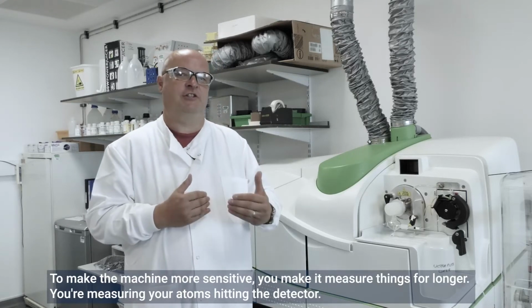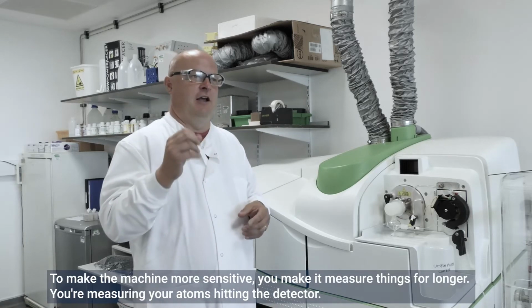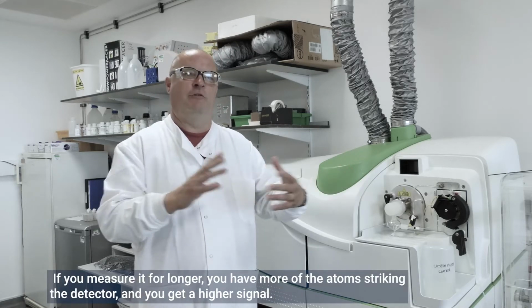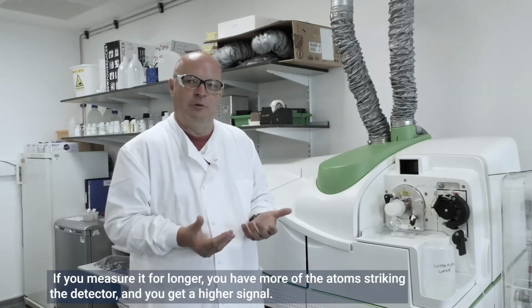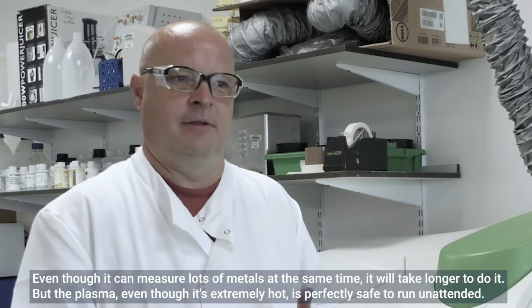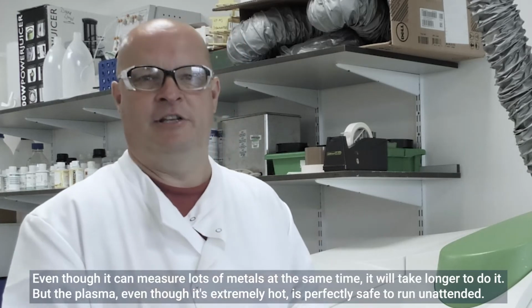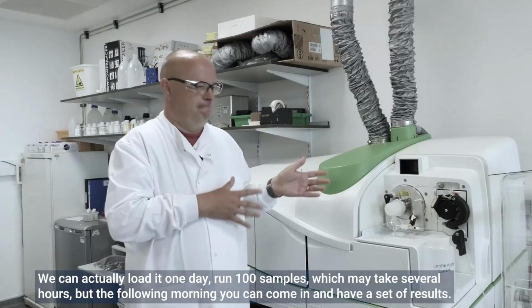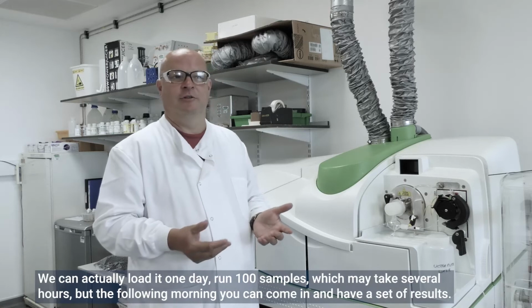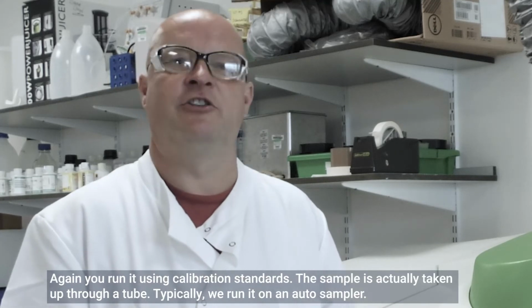To make the machine more sensitive, you make it measure things for longer. So you're actually measuring your atom hitting the detector. If you measure it for long enough, more of the atoms hit the detector and you get a better signal. Even though it can measure lots of metals at the same time, it will take longer to do it. But the plasma, even though it's extremely hot, is perfectly safe to run unattended. So we can load it one day and run 100 samples. It takes several hours, but the following morning you can come in and have a set of results. Again, you run it using calibration standards.